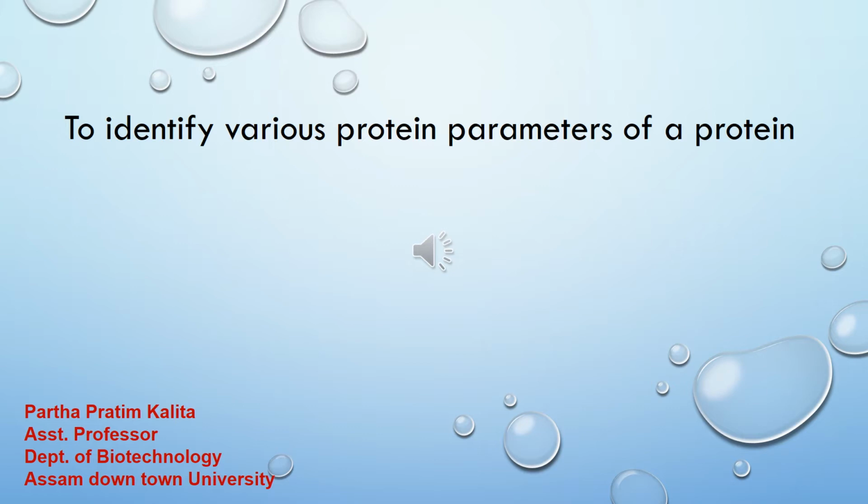The protein can either be specified as a Swiss-Prot or TrEMBL accession number or ID, or in the form of a raw sequence. But always remember, this software ignores numbers, meaning if you put numbers they will not give you a result.